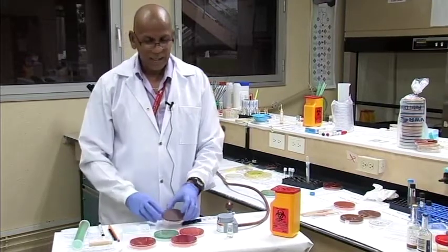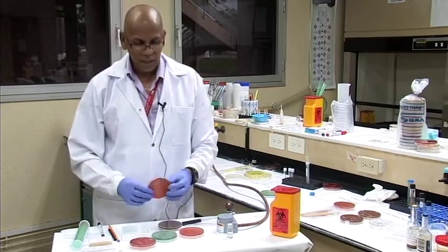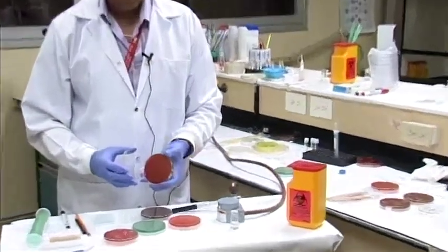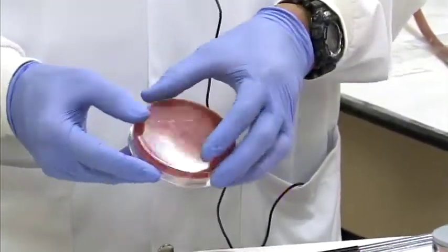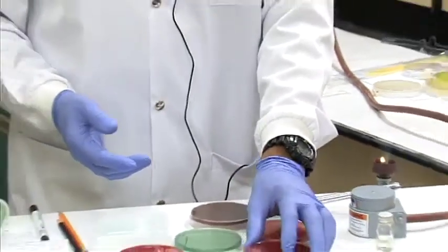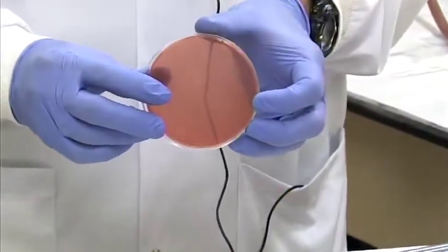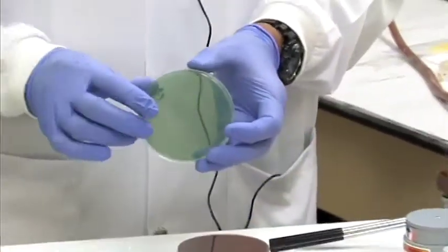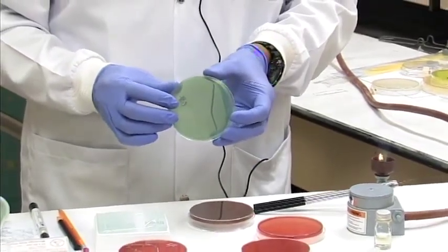Now agar plates that have not been inoculated come in a variety of forms for different specimens and so on. Here we have a blood agar plate, nicely bright red in color, that is made from sheep blood, animal blood. It's the best type of blood to use for our blood agar plates. Here we have MacConkey agar, which is used to grow your gram-negative rods. We have CLED agar, a nice greenish color that's used for the culture of urine samples.